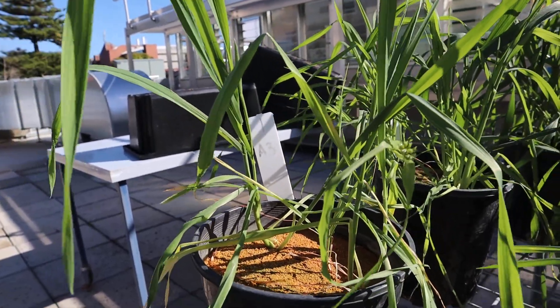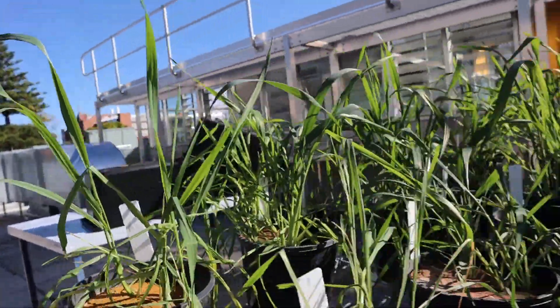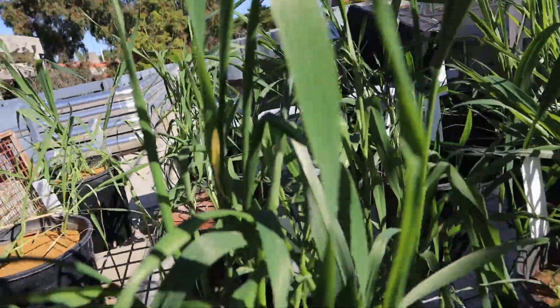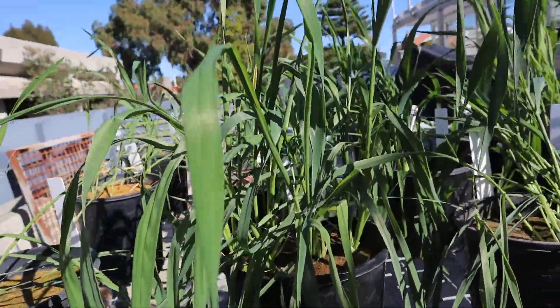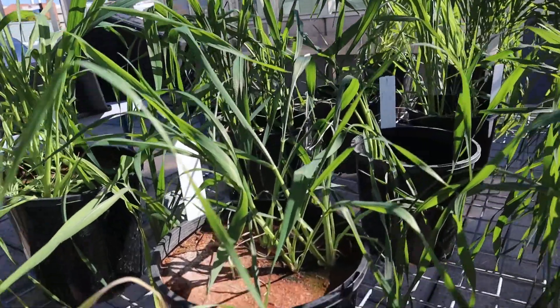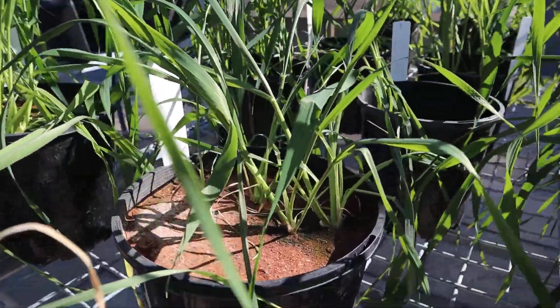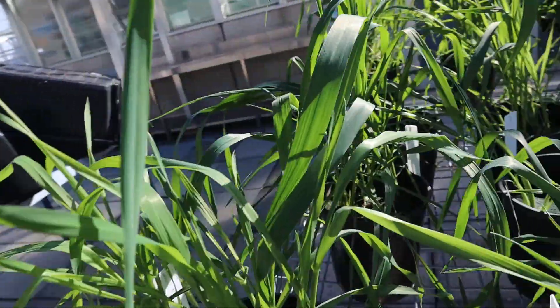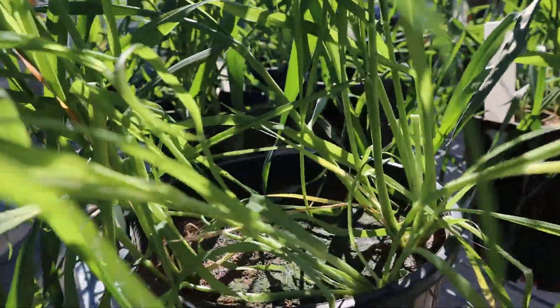The next soil is soil B. We've got some growth in this plant pot, though not so great in this pot. Getting a little bit closer — there's reasonable growth in this pot.